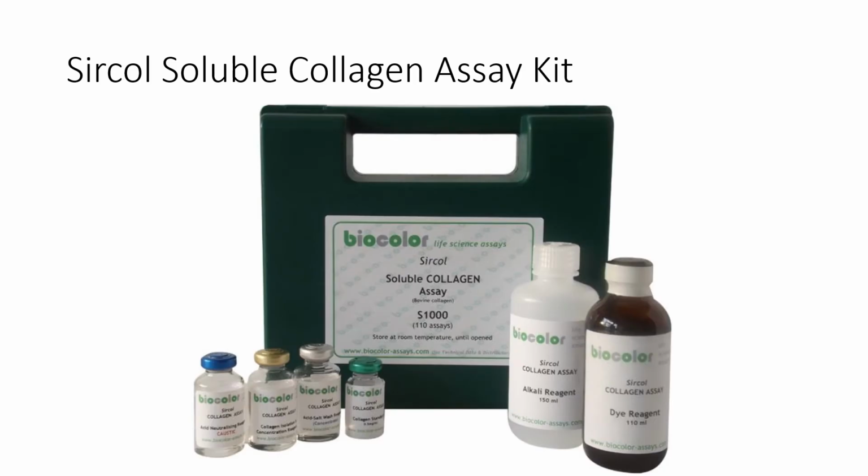So in this lab, you can see on the picture here we have a Sircol soluble collagen assay kit. This is a commercially available kit from the company Biocolor, and we're going to be using this kit to determine the soluble collagen content within our gel samples.